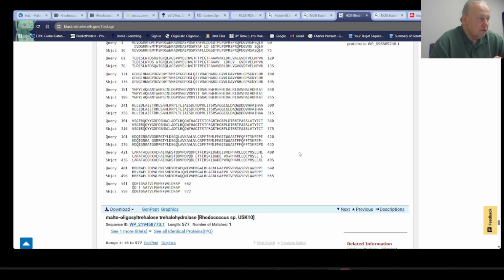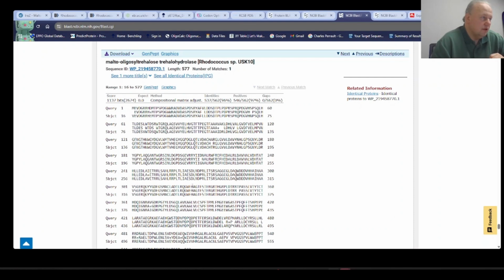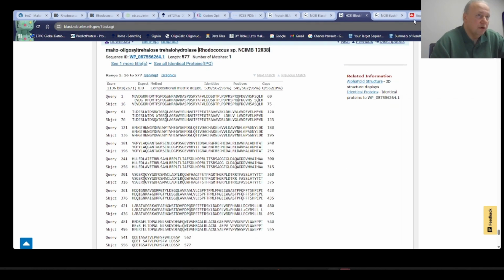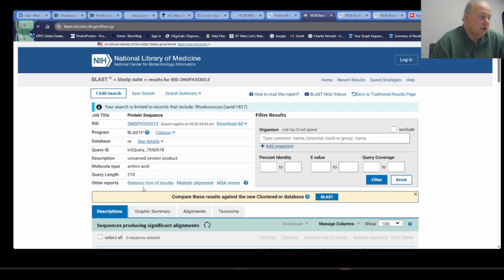So at this point we have two options. Option one is we just take the first 16 residues of what appear to be very, very similar proteins. Look at these similarities, 96%, 97% positive, so on, and just transplant them and hope for the best. Or we're going to take a look at what this guy blasts against and see what happens.